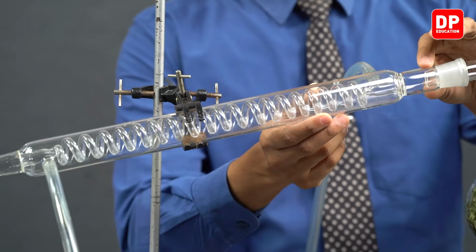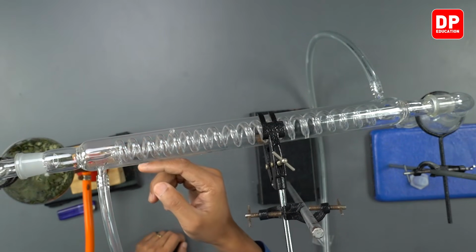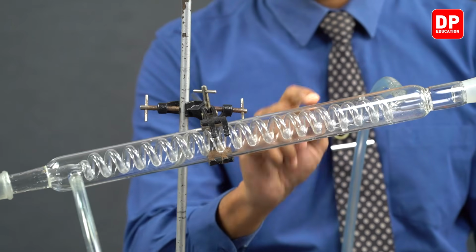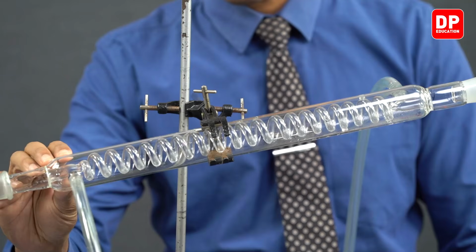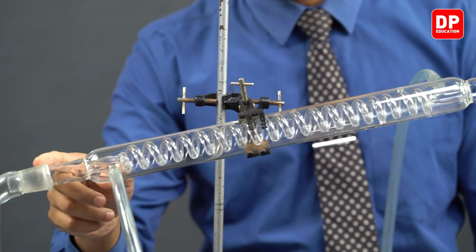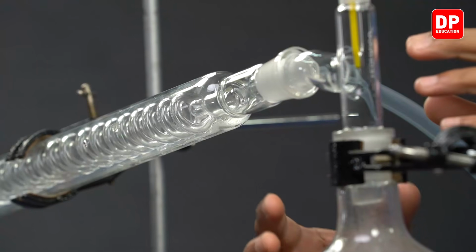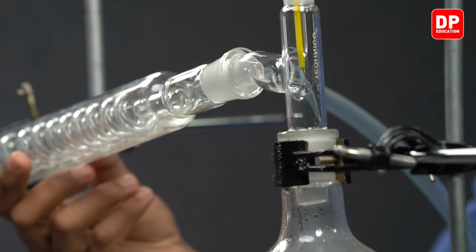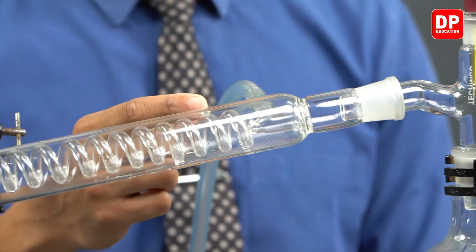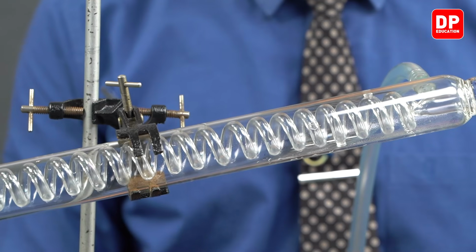So this condenser will carry the gaseous mixture in this swirling glass tube, and it will carry the vapor mixture all the way to the end of the condenser that we see over here. The gaseous mixture that is produced will be directed towards this spiraling glass tube that you see inside this Graham condenser.